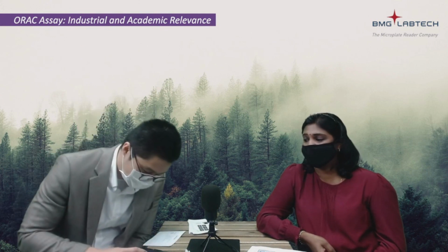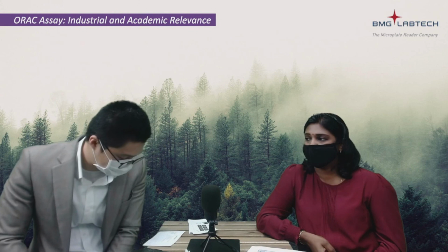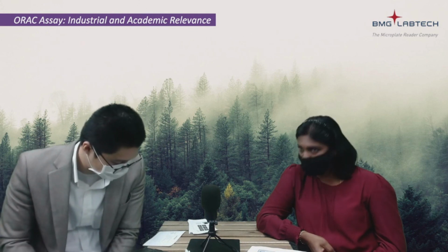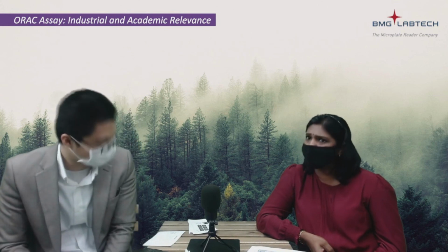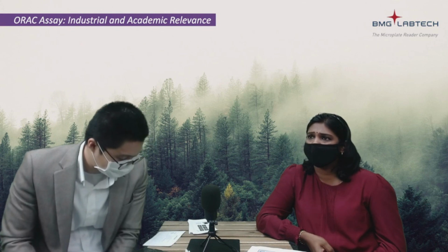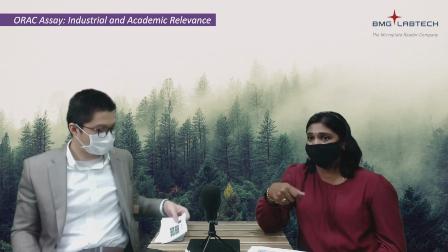Okay. The next question I have is from Michael. If we are dealing with 96 samples, does the speed of addition of the free radical initiator solution affect the readings if we were to manually pipette to all wells? I think we sort of touched on this just now. Yeah, so this is a question on manual pipetting compared to automatic injection. Yes, definitely there will be a difference, because when you introduce your free radical into the 96 wells, by the time you finish your 96th well, the reaction has already started occurring. So definitely it will affect your readings.